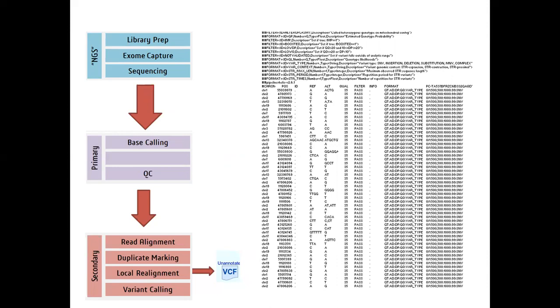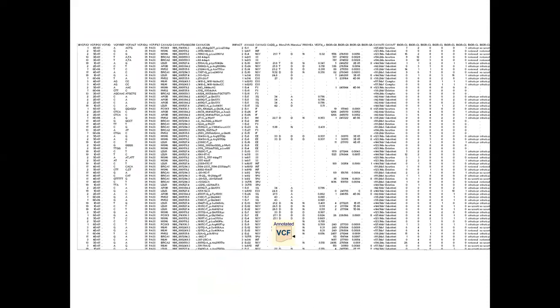Simultaneously, if you have your own VCF, you can look at it and try to analyze that sample. But when you are trying to analyze your sample, you should have the complete patient history and the family history. That is very, very important. Phenotypes are important when you interpret your VCF. When you are using the filter for your disease, you should understand the disease and the already known genes associated with it, because first you have to evaluate those genes associated with that disease. I will show you how you can take the gene list for your phenotypes.